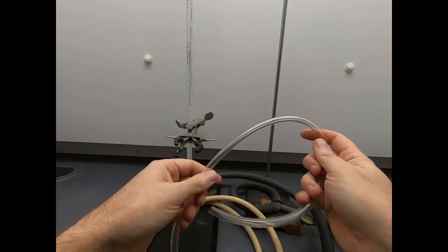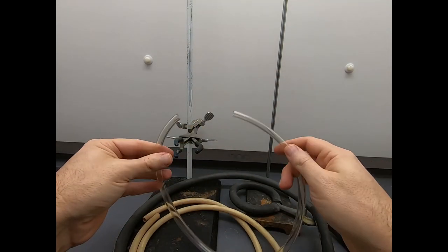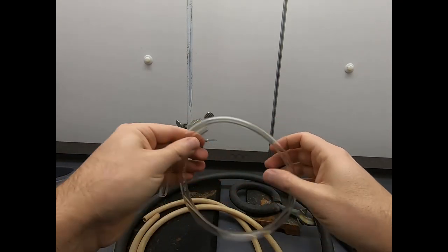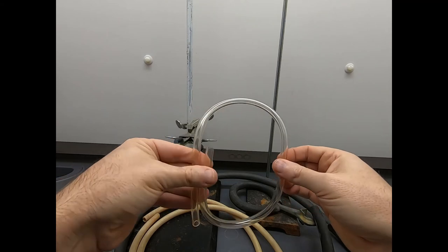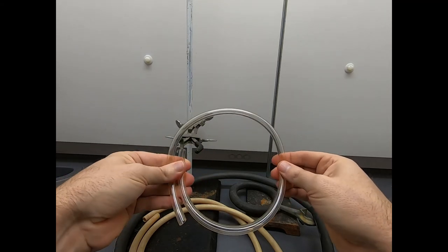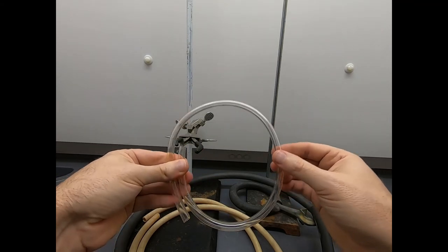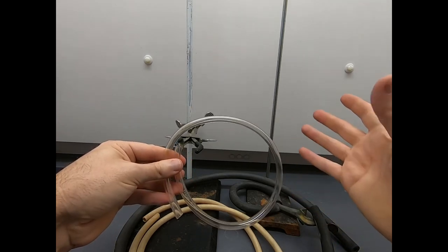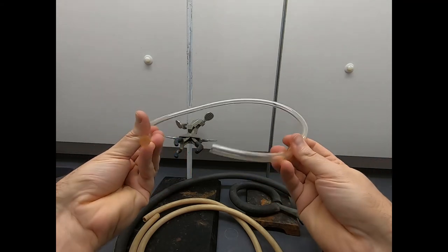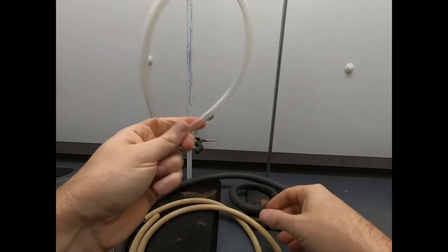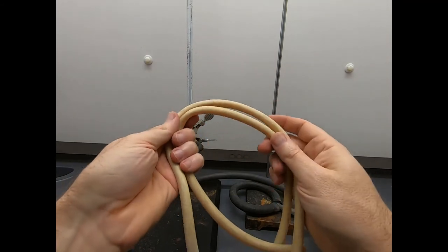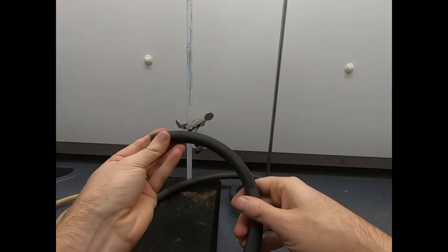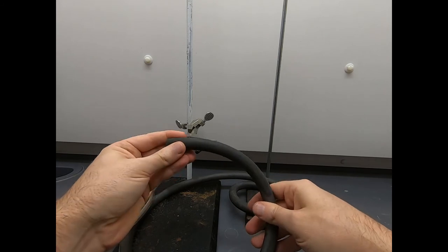There is narrower wall tubing, and that would be something like this amber tubing. These are great for water lines when you need to move water from the sink through your glassware. This is fine for water, but this will not hold up to a vacuum. If you put a vacuum on this, it would suck down and collapse. So amber tubing is typically used for water and condenser lines, not vacuum. For vacuum, you need the heavy wall tubing. Another type of tubing that you may or may not encounter in an intro organic lab is Tygon tubing. Tygon tubing is really good for transferring gases. If you need to keep a reaction under nitrogen or argon or some inert atmosphere, this is great for moving gases. Typically, Tygon is for gases. Amber tubing is for water, almost always just water. And then finally, we have the heavy wall tubing for vacuum lines.